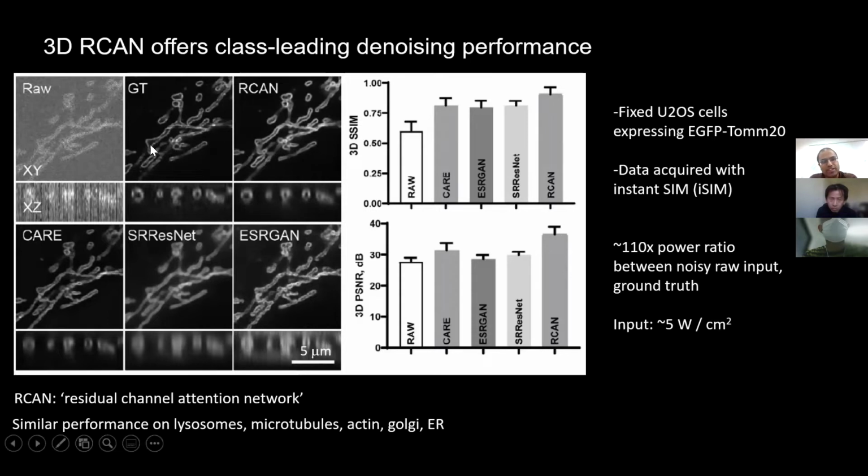If you turn the laser intensity up 100-fold, now the ground truth-like data, you can actually see a lot, right? You can see both in the XY and the axial view that this fluorophore goes to the outside. The tag goes to the outside of the mitochondria.